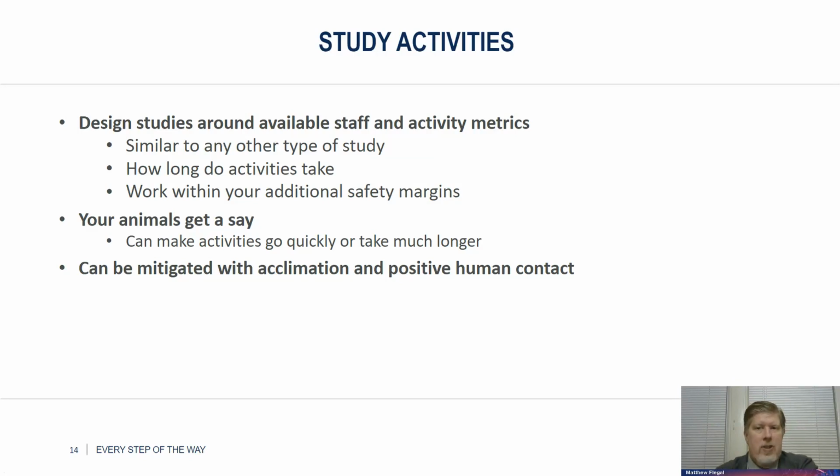If you're looking at a study and you have no alternative, then so be it. But if you do have an alternative and you look and go, well, each of these activities should take exactly 30 seconds, so I should be able to get 3 activities done within a little over a minute. Best case scenario, maybe you can. Fairly frequently, that's not how it's going to work out. And if it was really critical that you get data.